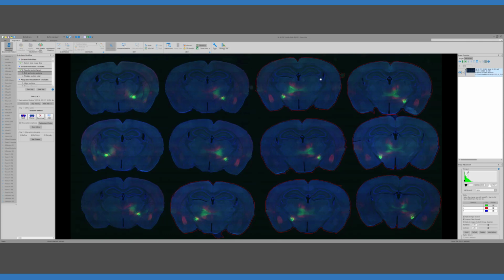One thing we might do sometimes is that when there's a little blip there, we can remove that. I think that one, if you split that contour, I bet it'll find that little segment. Yeah, it should. And you just delete it. So there's some cleaning up that can be done. Anyway, so now I've selected 7 of the sections from this, and we say we're done editing.